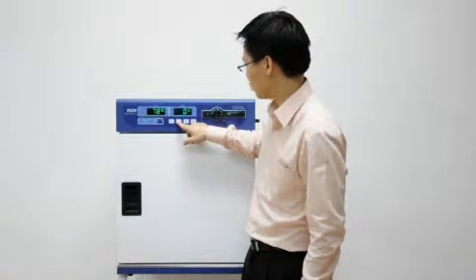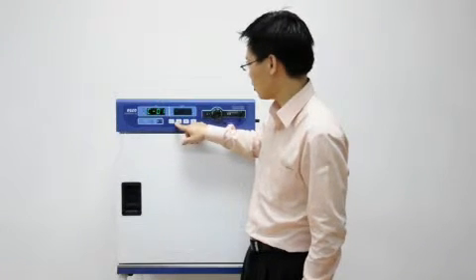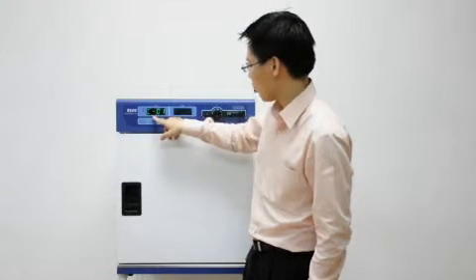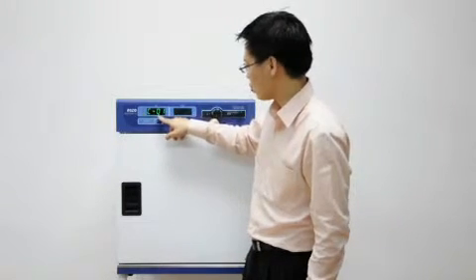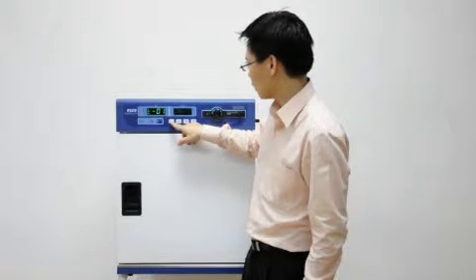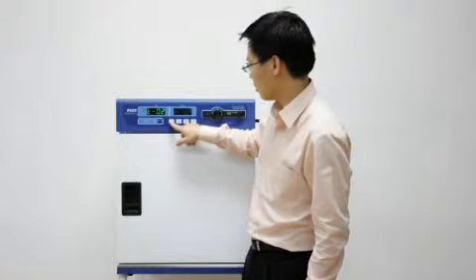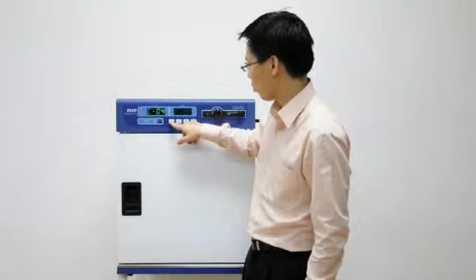Now in program one, I have to set up a configuration. So this is the C-01 refers to the temperature for the first segment, T-01 refers to the time for the first segment, and for the second segment, third segment, fourth segment, fifth segment.